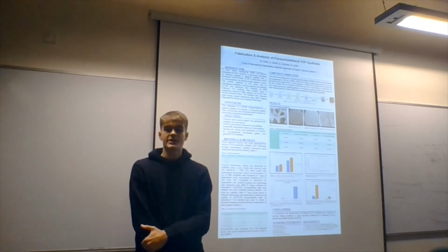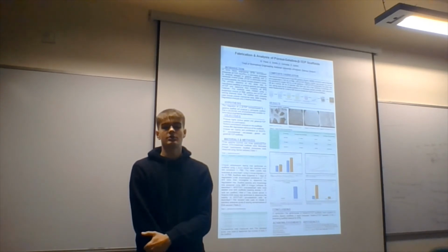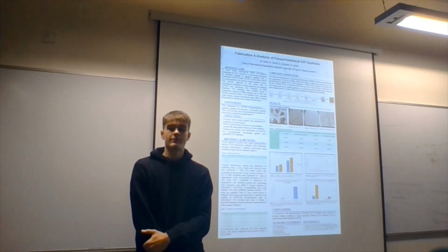Figure 7 shows the stress versus strain curve used to predict the compressibility of the material and calculate the compressive modulus, which is presented in figure 8 as a comparison between the 2. The beta-TCP scaffold withstands 500 kilopascals of compressive stress, which is about 2,500% higher than the pristine scaffold. Finally, figure 9 shows the cell proliferation on gelatin and gelatin with beta-TCP scaffolds. The cell proliferation in the porous beta-TCP scaffold is much more present than on the standalone gelatin scaffolds.